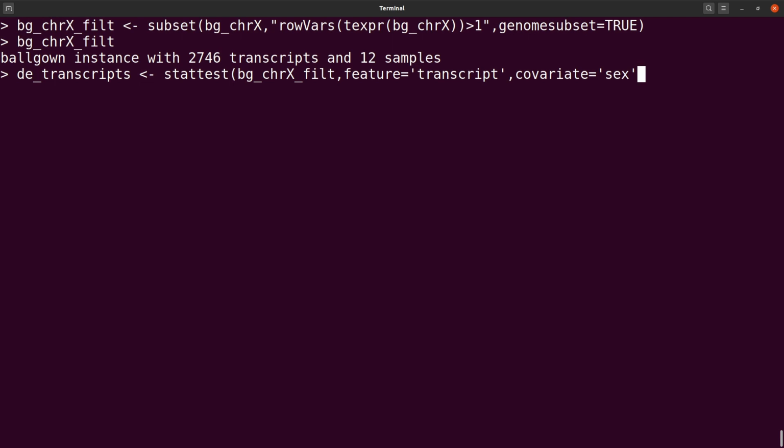We also need to specify adjustvars, which is here. That's equals to c population. Let me just make sure I have spelled population correctly. Yeah, okay, it's here. Population. Yeah, perfect. So that is it.